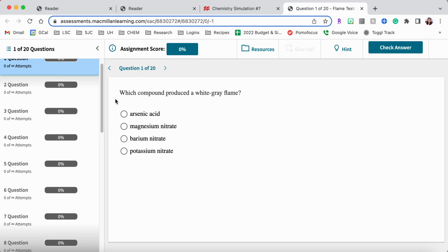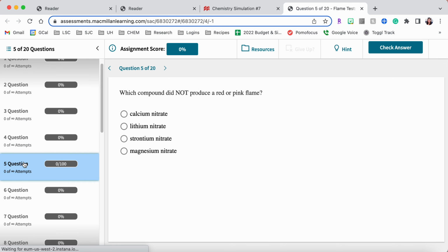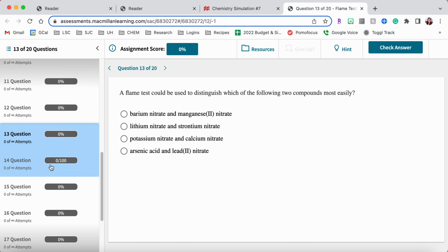You're not measuring things with a scale, with a graduated cylinder where you record a measurement and a unit. This is fully qualitative, and you'll notice that the questions match that, right? So instead of asking about numbers, how much mass you got, it's asking about the colors and what solutions matched a certain color. So I think this lab is pretty straightforward.